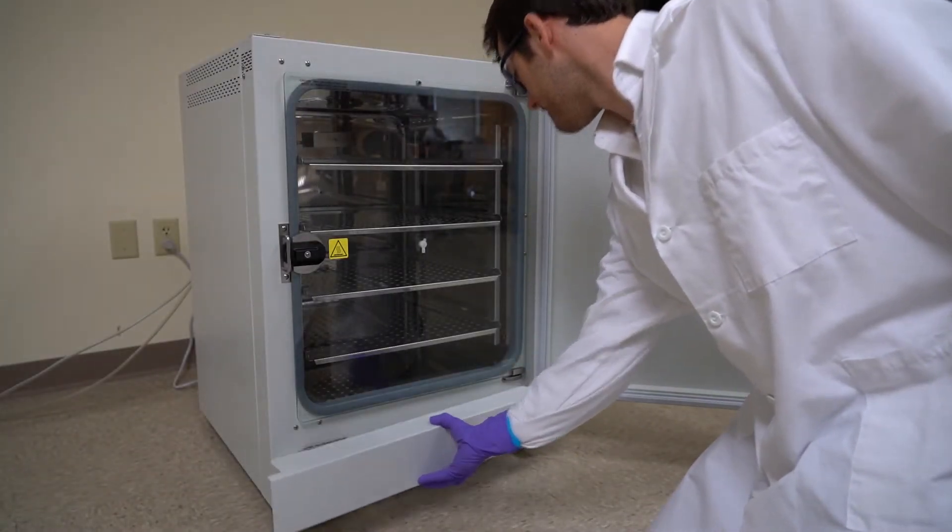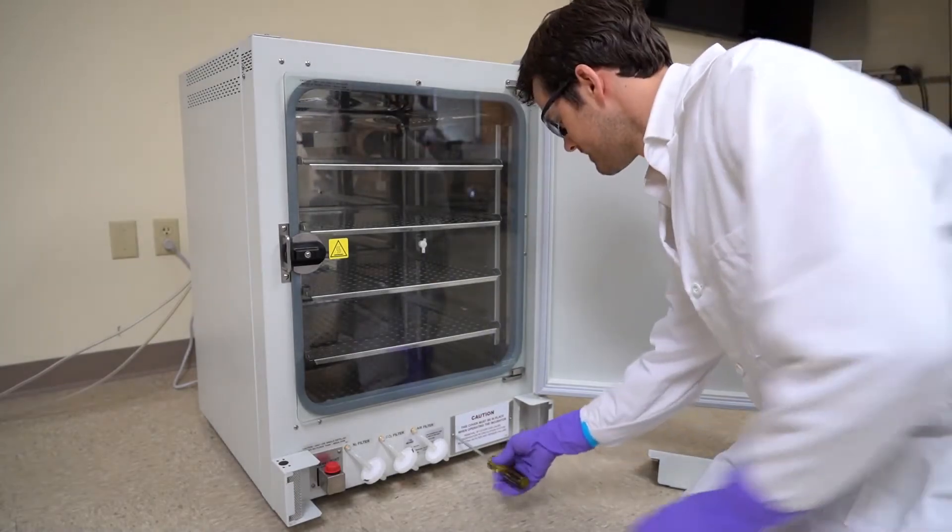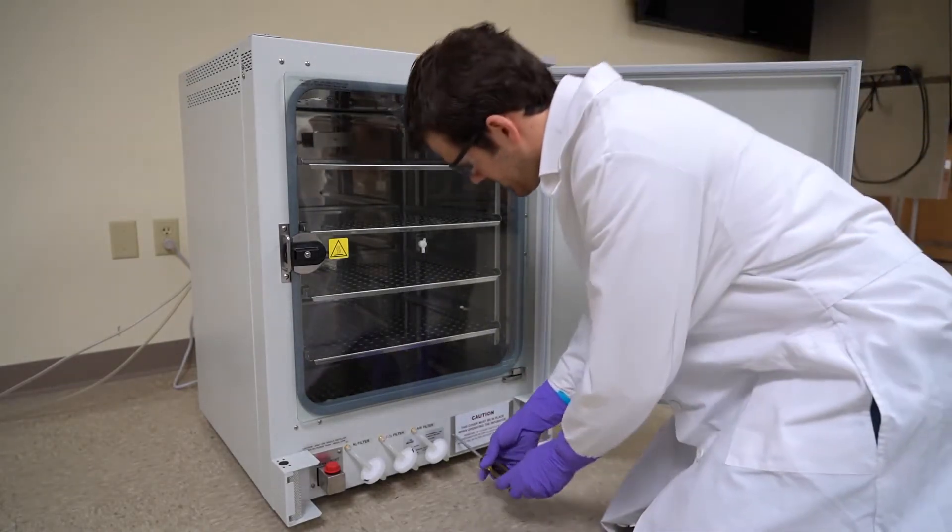Open the doors and remove the valance to access the sensor bay cover. Remove the screws securing the sensor bay cover.